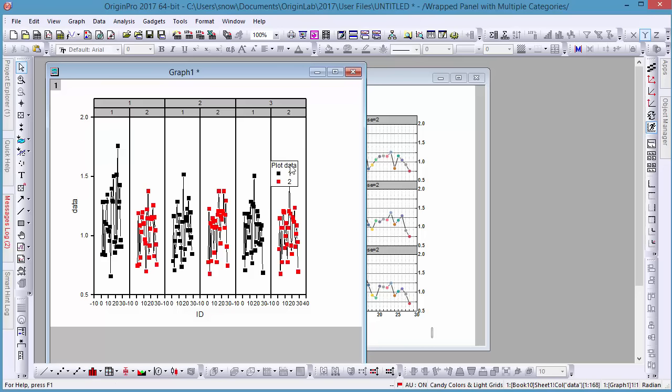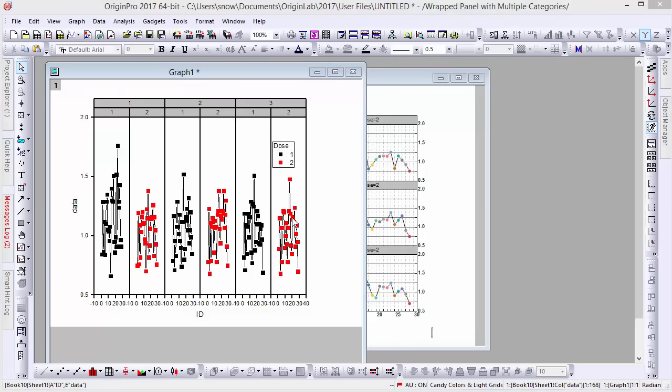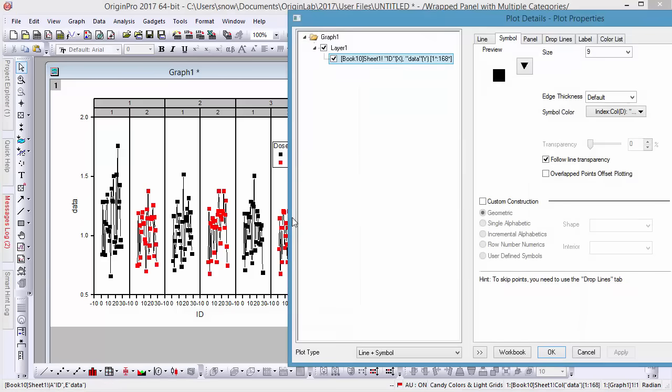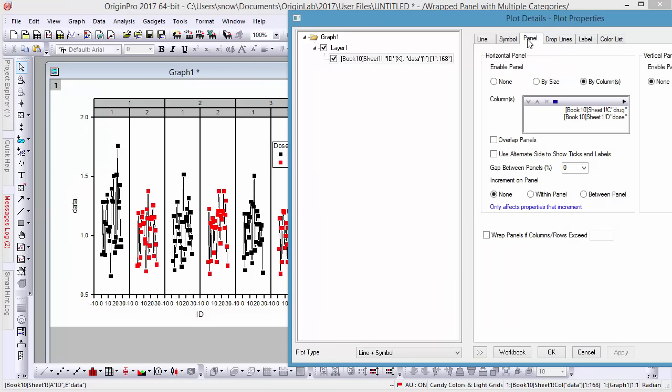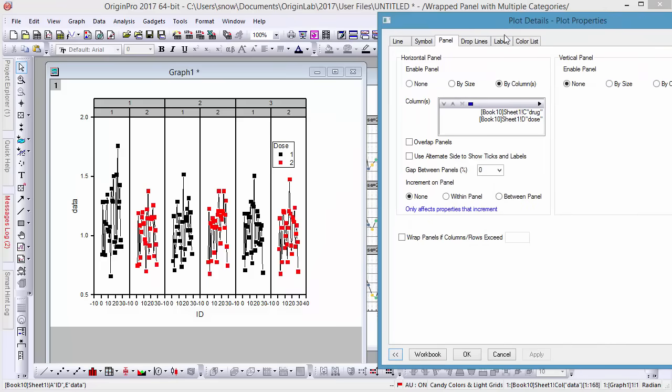Now if we update the legend, we'll see it now indicates for dose. You can further customize the panel details dialog on the newly added panel tab for each plot. It's important to note, however, that if multiple data are together, they will share the same plot layout.